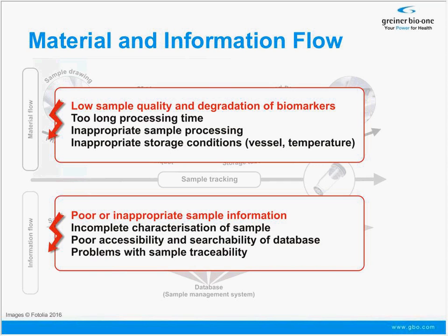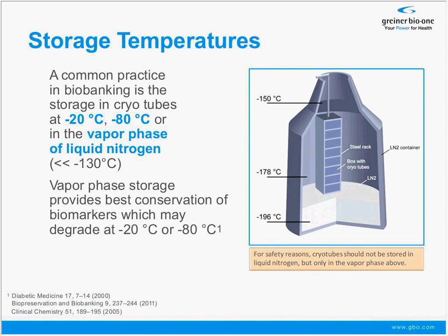I want to spend one slide on storage temperatures and what can be recommended here, and then we can use these slides to come to the conclusion and the actual topic, what makes a good biobanking tube. But before that, a few words on storage temperatures. On this slide, you see to the right-hand side a liquid nitrogen tank. It is opened so that you can see the area. Many of you are familiar with that.